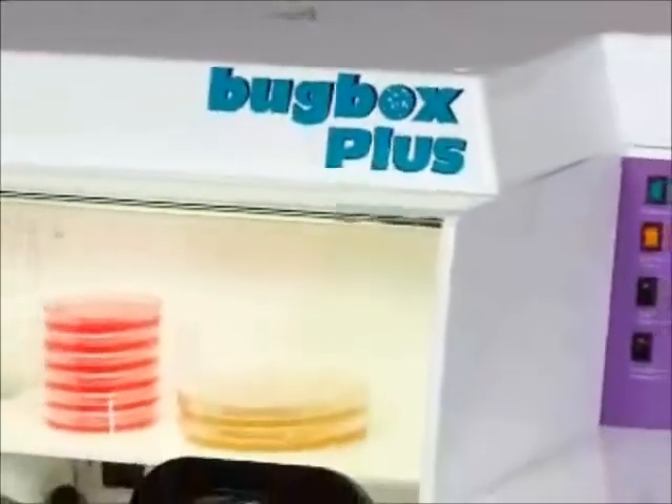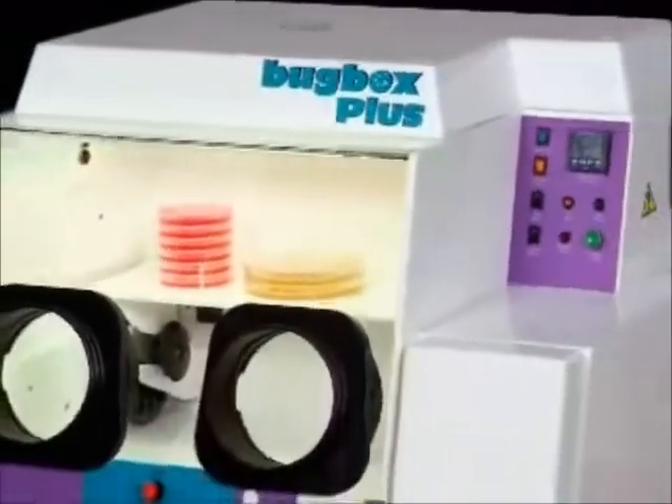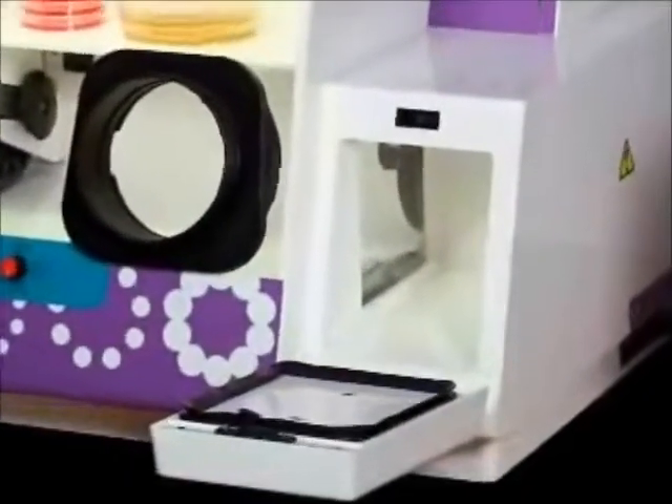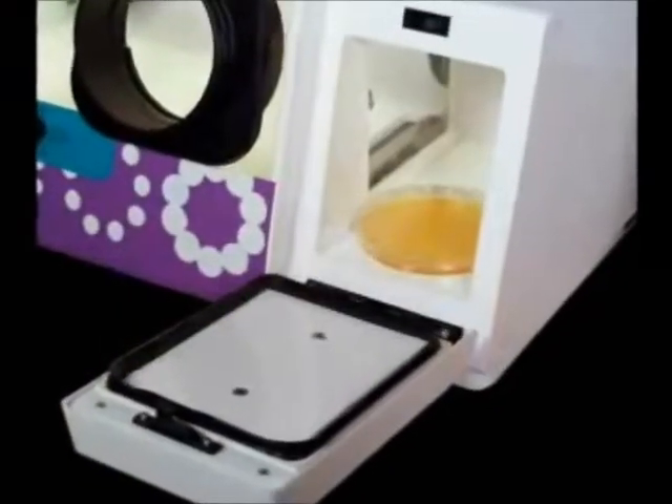The Ruskin Bug Box Plus offers a similar compact footprint to the Bug Box, but features a larger front-loading interlock with more room for transferring jars and flasks, and easily accommodates 15-centimeter plates.